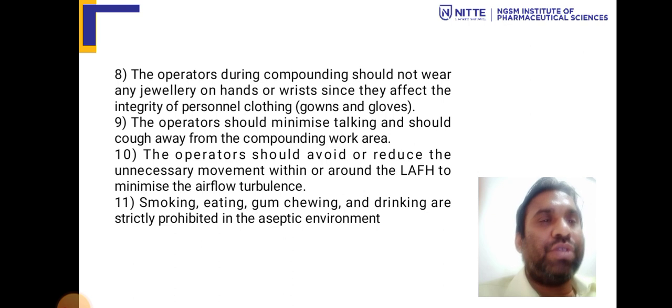Operators should minimize talking and should avoid coughing in the compounding area. Operators should avoid or reduce unnecessary movements within or around the laminar airflow hood to minimize air turbulence. Smoking, eating, chewing gum, and drinking are strictly prohibited in an aseptic environment.